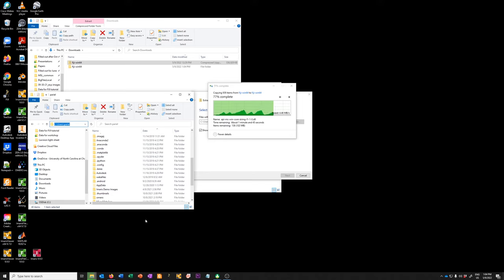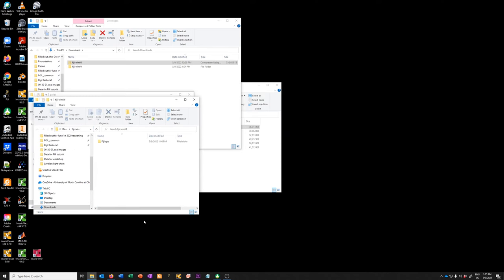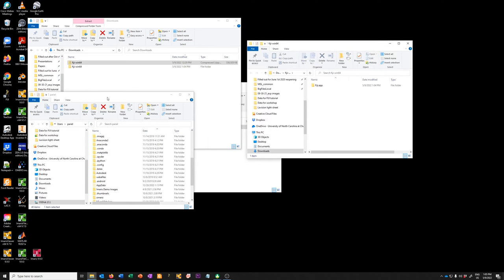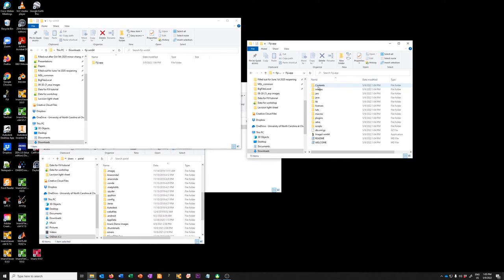One other thing to note is that Fiji is constantly updated, so the particular version you'll see in this video is the one available today, May 9th, 2022.